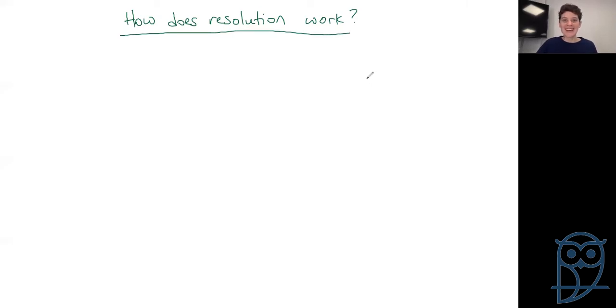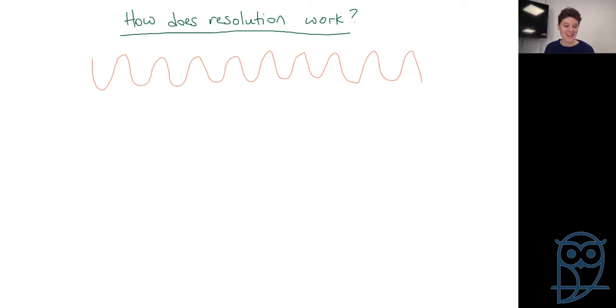It's all about wavelengths. So let us have a wave. Don't take this to your physics teacher. But there we have a wave of radiation. If we put something in there, our wave just keeps going. If we put something else in there, we have now interrupted our wave. This one is not visible.